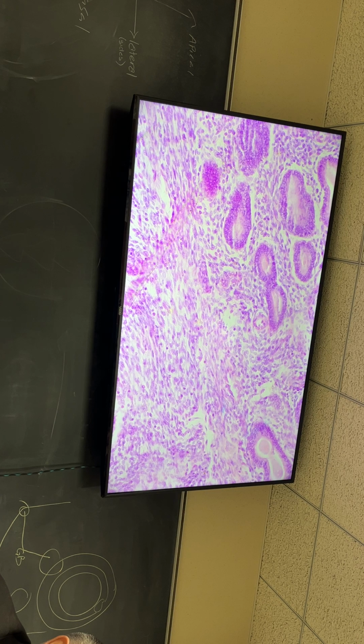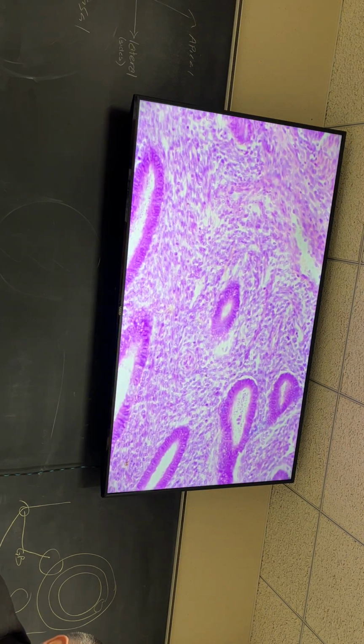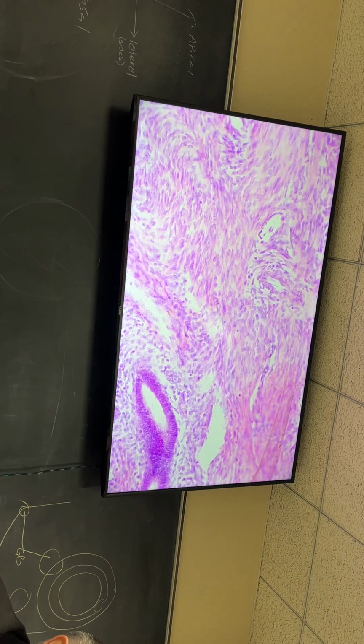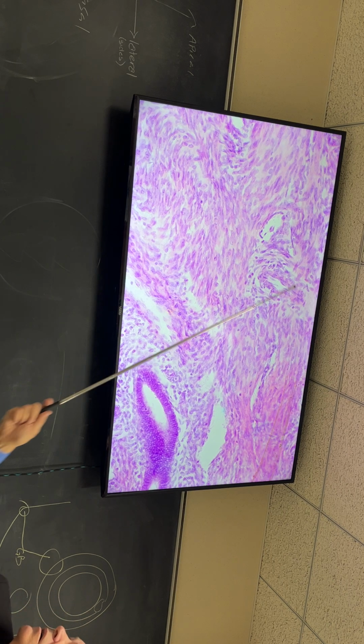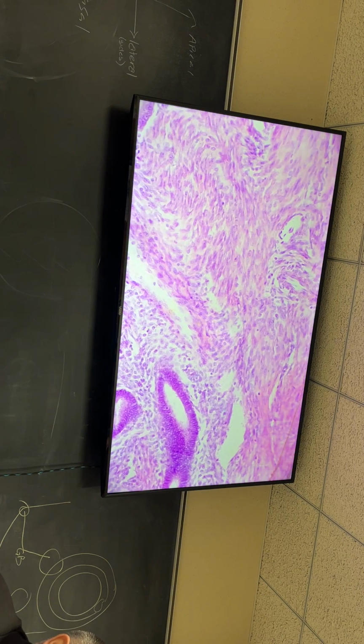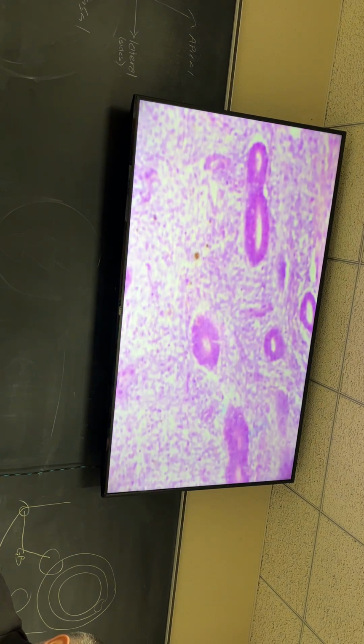If you see an artery or a blood vessel, let me know, right? Anybody see one yet? I think we passed one right there. Let me go up even further here. How about this? How does that look? Vein, right? Big vein there. You can see them a little bit here and there.